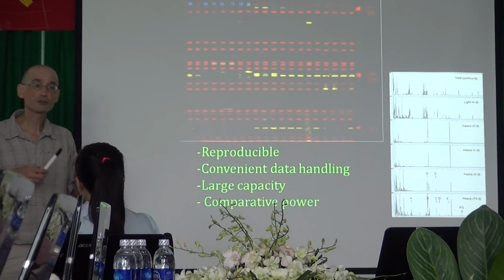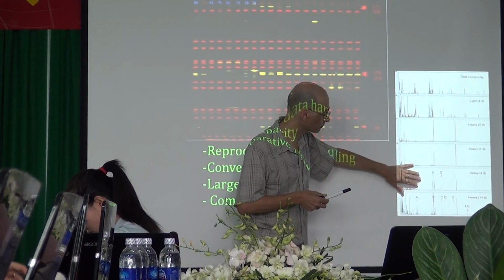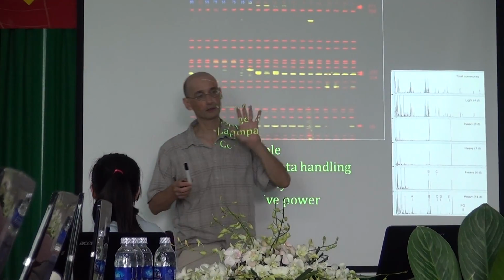You can even derive some general idea about the size of the different populations by the size of the peaks, but this is not very precise.